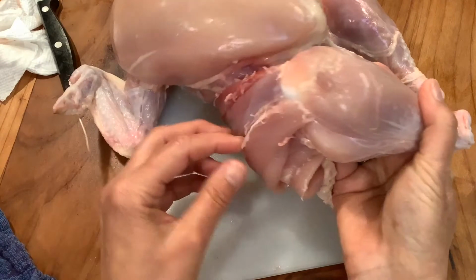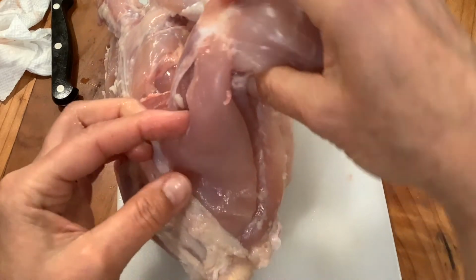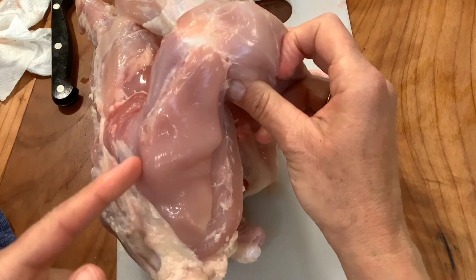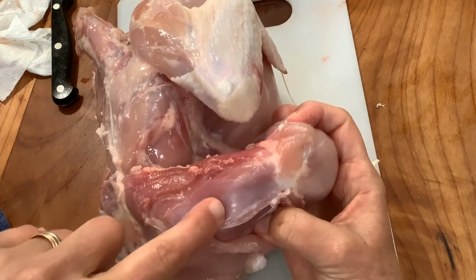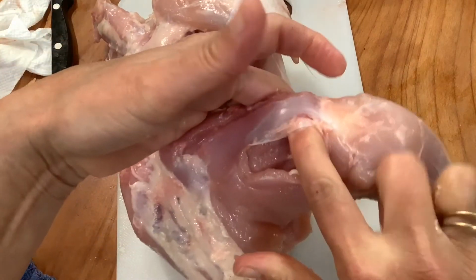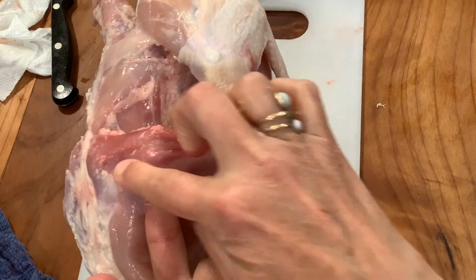On the lateral side of the leg, I was able to find kind of a line. That was the top edge of the biceps femoris. It's pretty thick compared to the other muscles, and it sort of made a little curved line right here that I cut through the epimysium. And then I could see the IT band, the iliotibial tract, and I think I can get my finger underneath it even and run my finger up underneath the tensor fascia lata, the muscle at the top of the IT band.